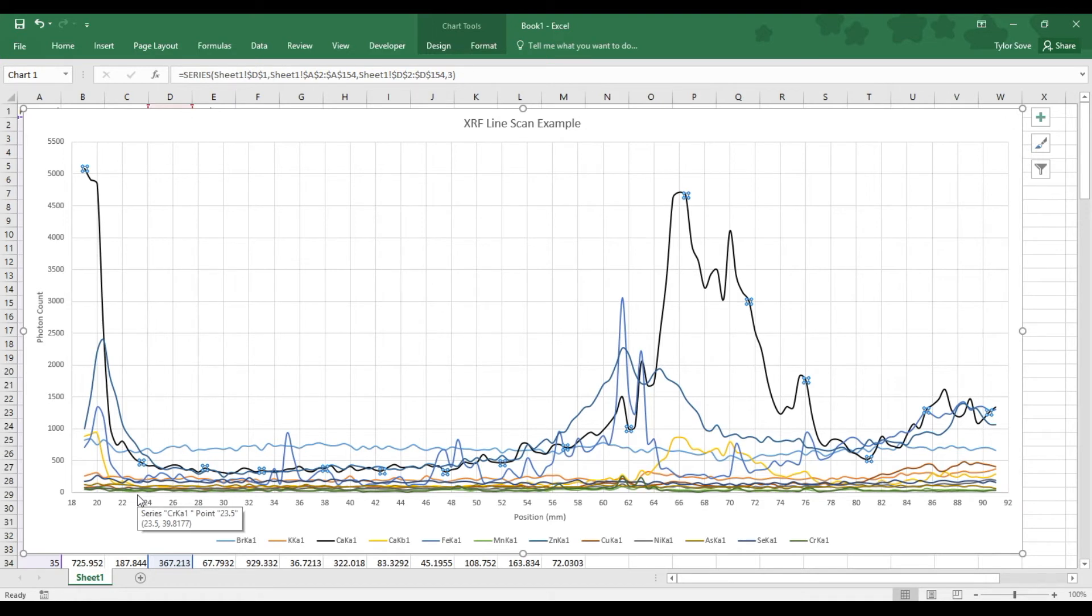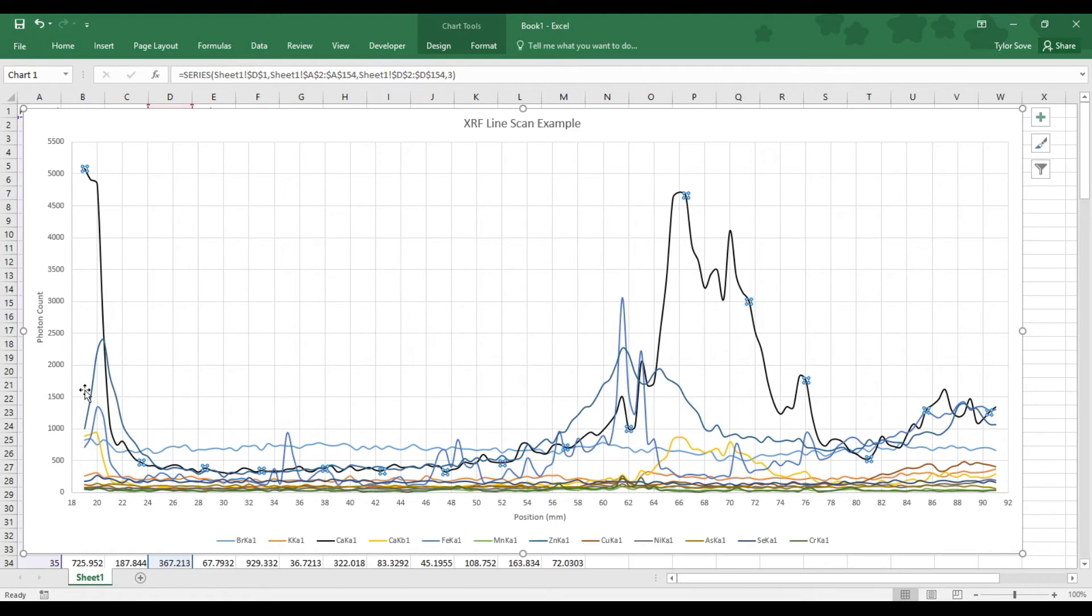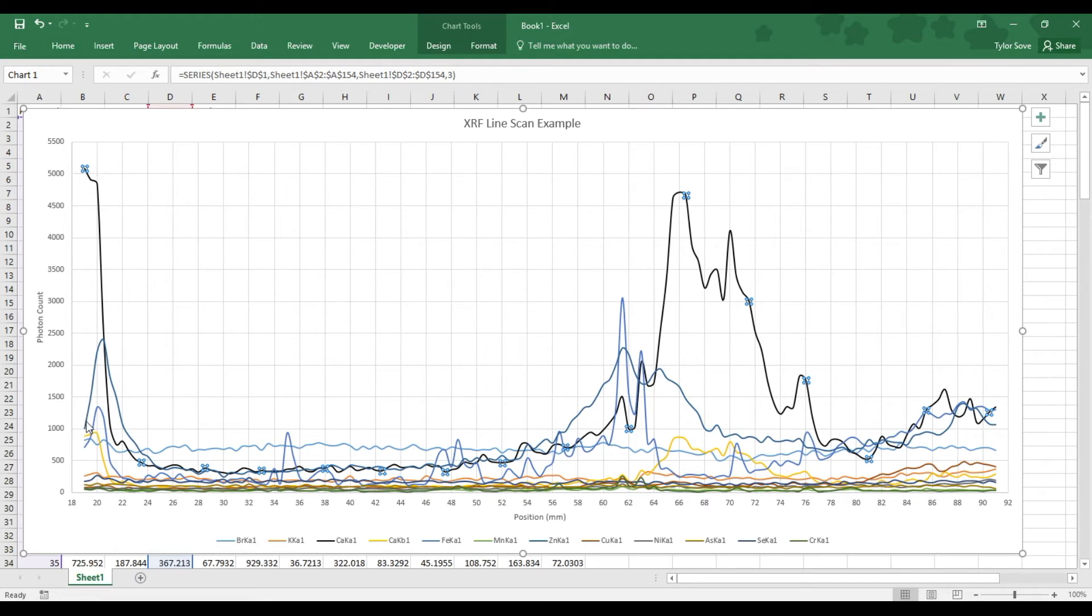But we can also learn how the chemistry changes with respect to itself. What I mean by that is we can look at the calcium and compare it to the zinc and see how they change with respect to each other. Initially, calcium was very abundant, and zinc not so much.